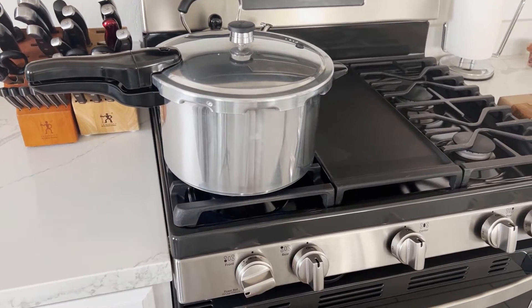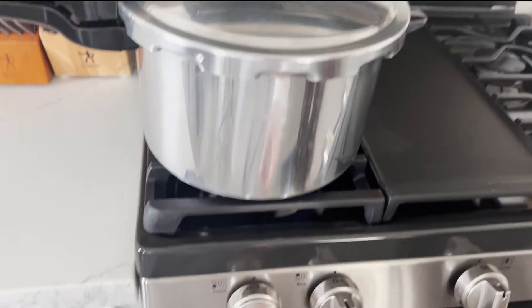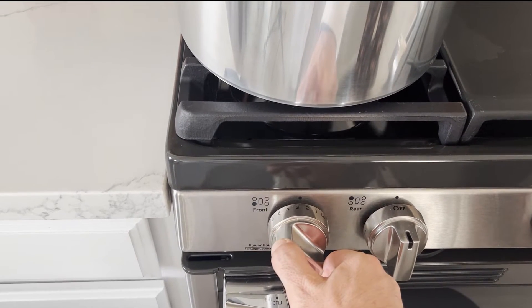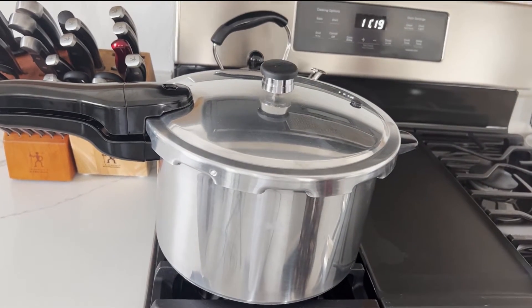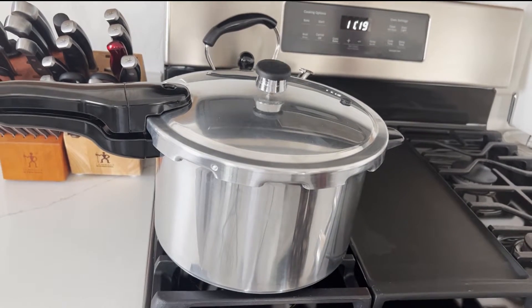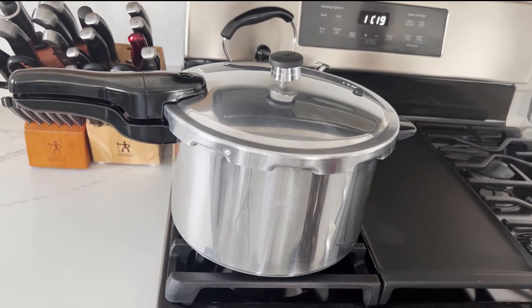Once we get to 15 PSI, we're going to maintain it there for 45 minutes when cooking agar. The rocker's starting to make some noise — that's 15 pounds. I'm turning it down to about two and a half. We're looking for it to just barely rock back and forth, which means 15 pounds of pressure and it's just letting off steam. If it's knocking too loud, you've got too much heat — turn it down a little bit.